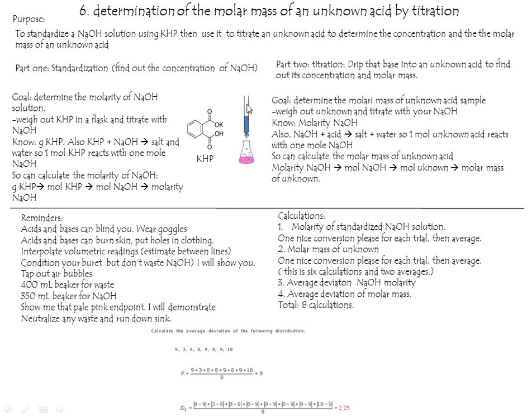Or even if it was neutral, that's silica, right? Silicon dioxide. It reacts slightly with base, and so if you just use clean glass, you'd get a slightly different molarity simply by pouring it in there. So what we'll do is we'll rinse it with some sodium hydroxide first, and then we'll add some fresh sodium hydroxide so it has been, quote unquote, conditioned.